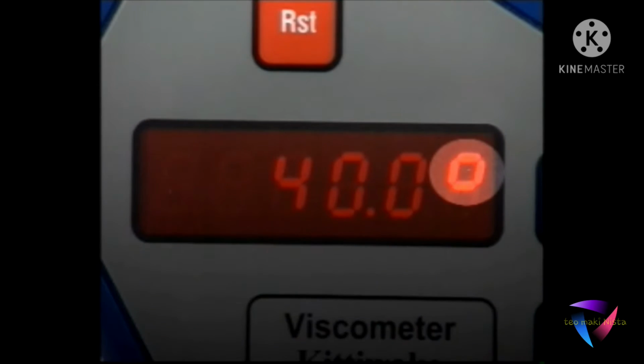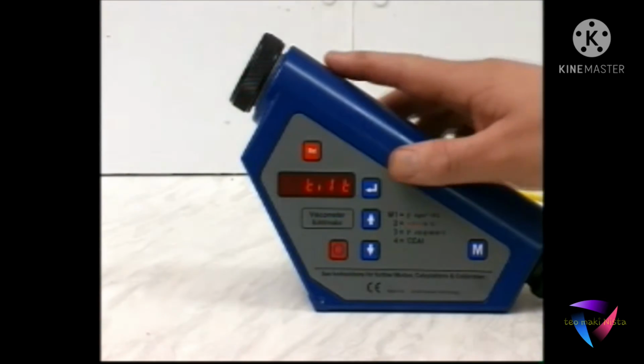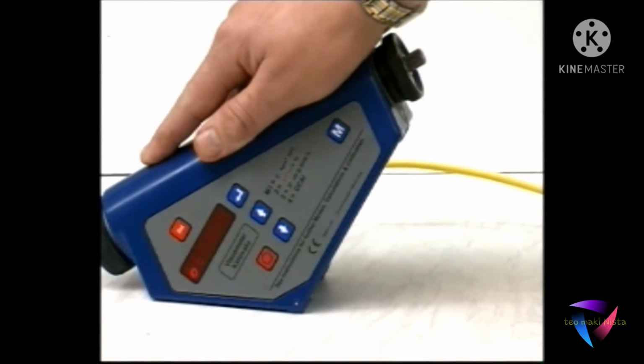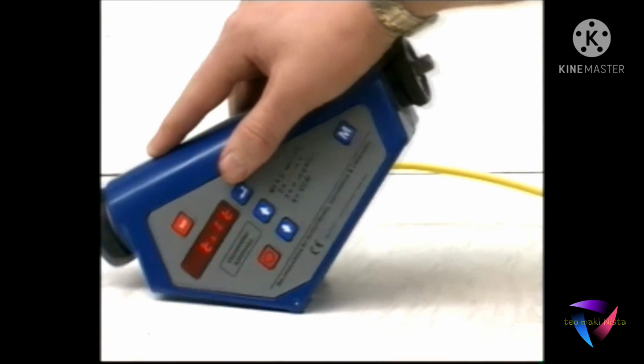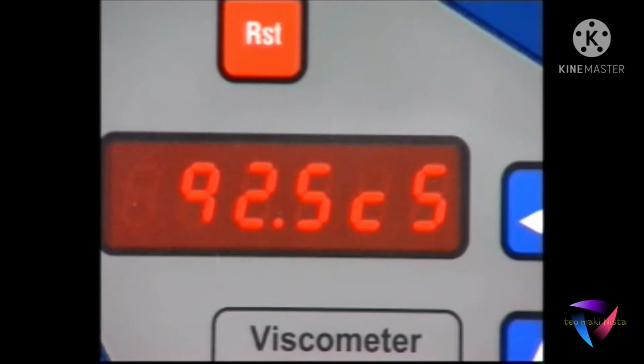Only tilt the viscometer when prompted. Now the display shows the viscosity. Wait for further tilt prompts before taking repeat readings.